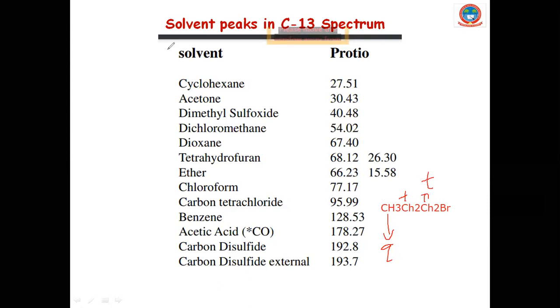Okay, let us go for another molecule. What do you say for this one? If you have CH2 double bond CH, then a single bond and again a CH2, and single bond, we can have a double bond, no problem, and CH2. See here, I need from you the decoupled spectrum, totally decoupled or broadband decoupled. So what do you say for this one?